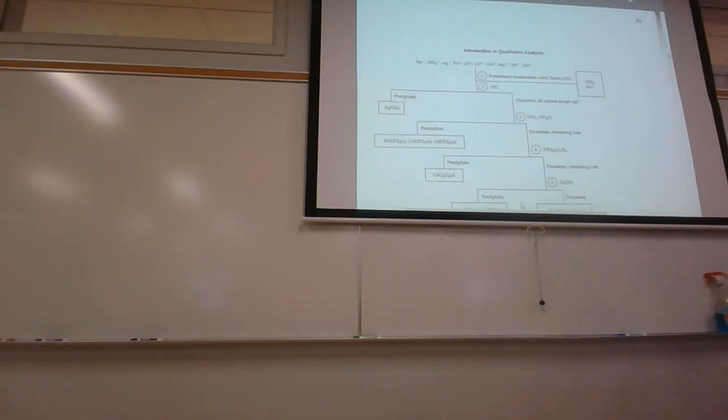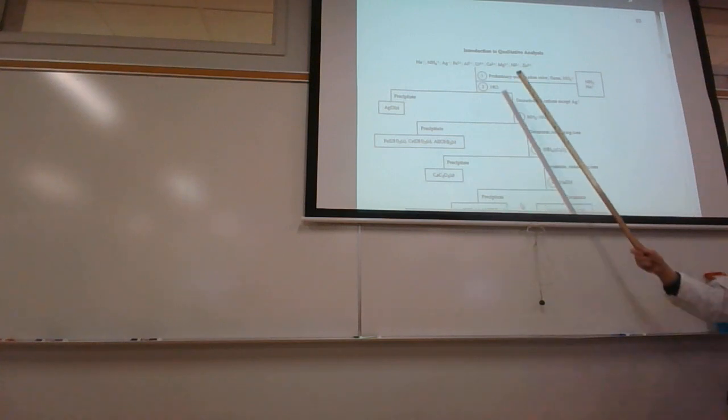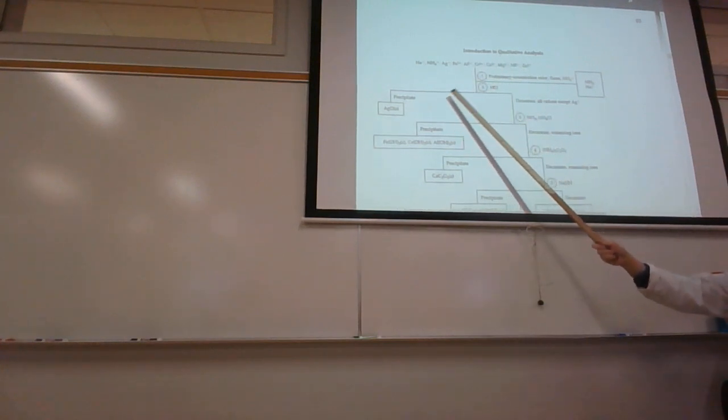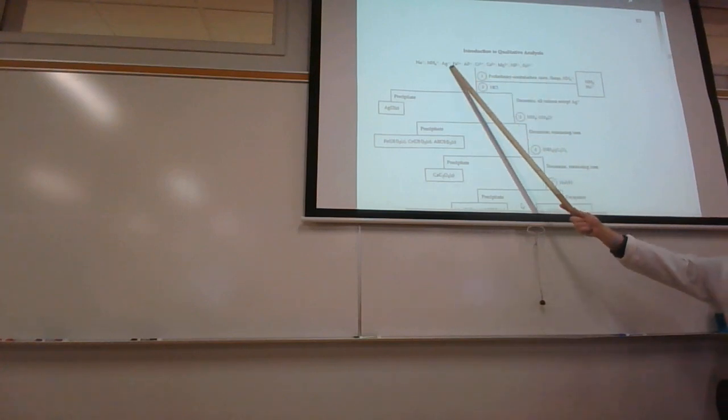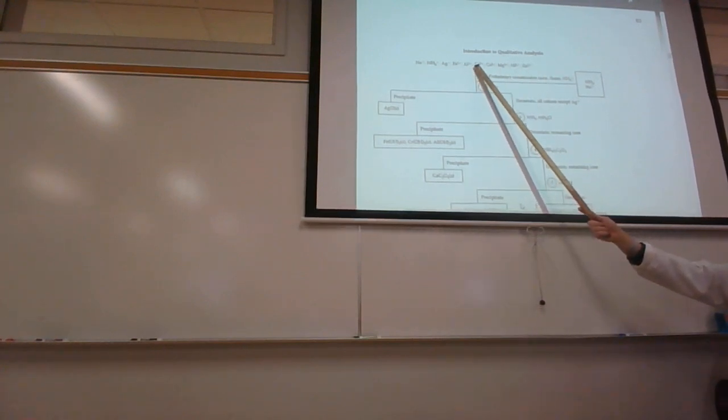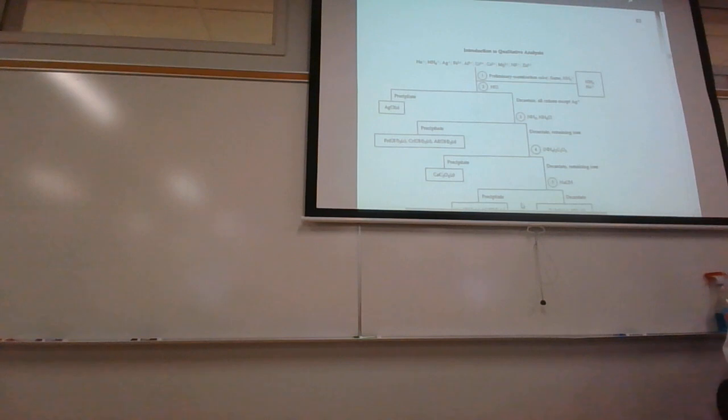So here's our introduction to qualitative analysis. This is how I prep my notebook. I just draw the flow chart in the notebook here. And then we go, well, what are the amounts? We need to know how much initial solution we need to start with. So let's see how much initial solution I need here.